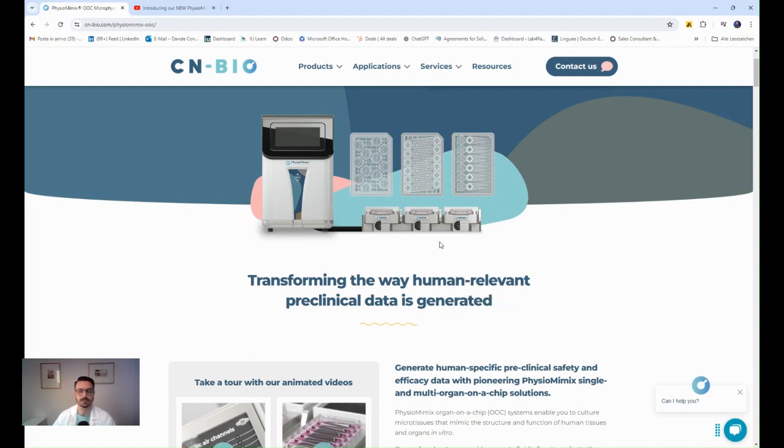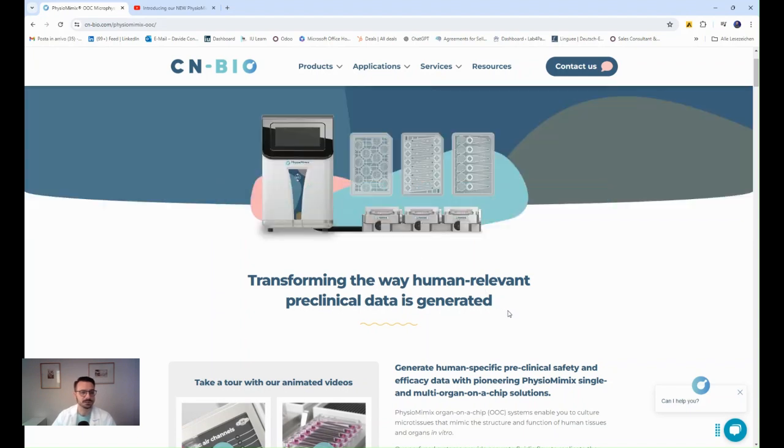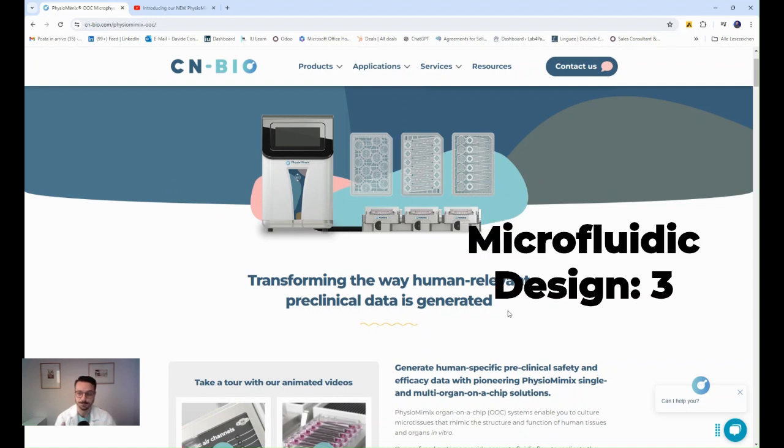In terms of the microfluidic design, here there are some particular configurations, but if you compare them with other systems where you might have also angiogenesis, so you might want to evaluate vasculature, this is relatively basic, so we will still keep it to a 3.